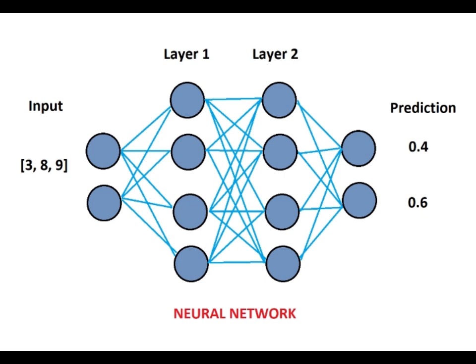The loss is used to tune the parameters in all the neurons to come up with a more accurate prediction. And this process gets repeated each time in each epoch until we find the optimal parameters.